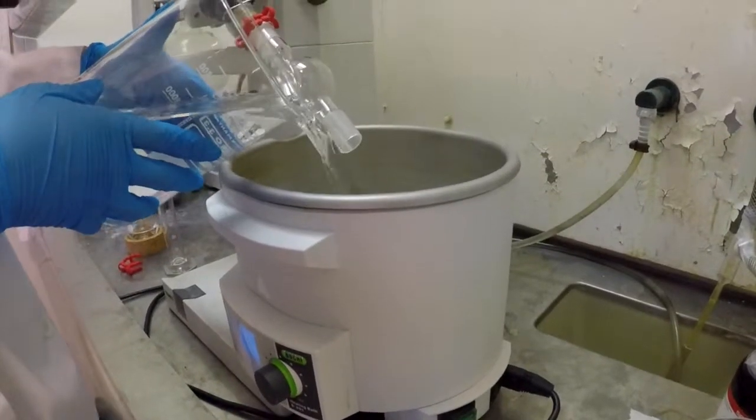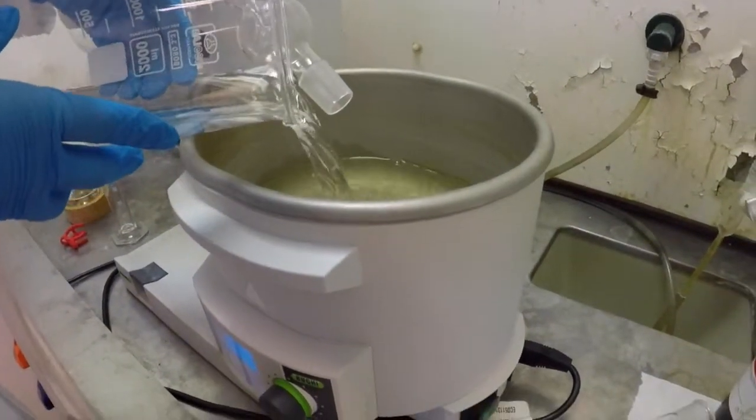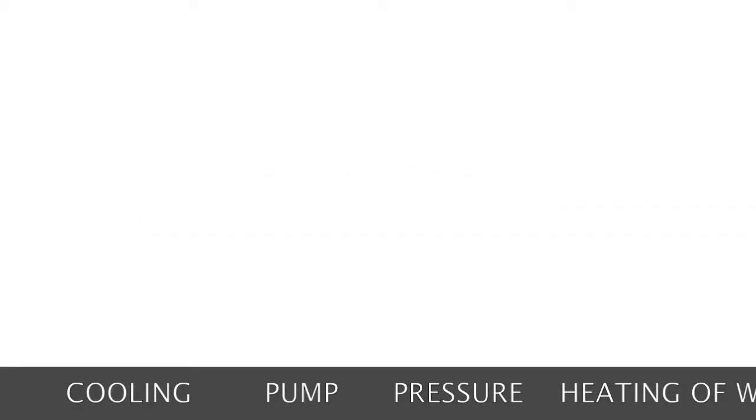The water bath is filled with ionized water. There are components that need to be set up before the process can start. These are the cooling, pump, pressure, heating of the water bath, and the rotation.